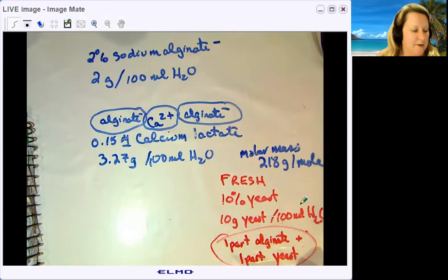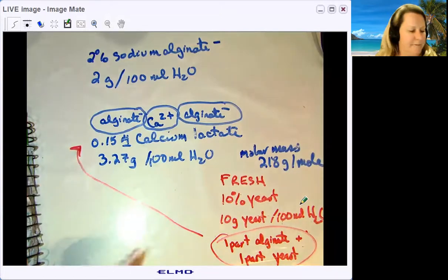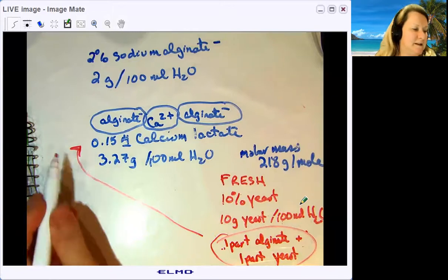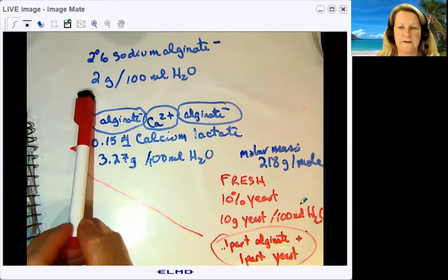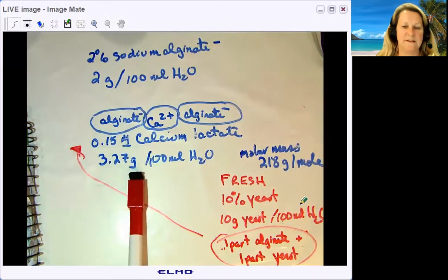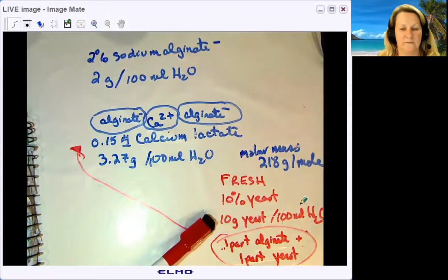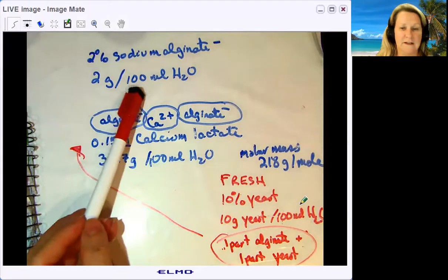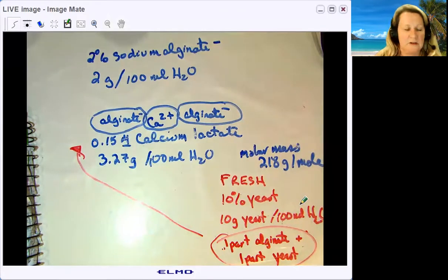Then you're going to take your syringe and suction up this solution. Very slowly, let it drip out of the syringe into the calcium lactate solution. As soon as this comes in contact with the calcium lactate, you'll see it polymerize and each drop will form really consistently sized yeast spheres. The yeast is the enzyme for the lab. What I usually do is take 100 mL of sodium alginate solution and 100 mL of yeast solution, throw them in a bigger beaker and stir them up. Suction it up with your syringe and put it drop by drop into the calcium lactate solution.